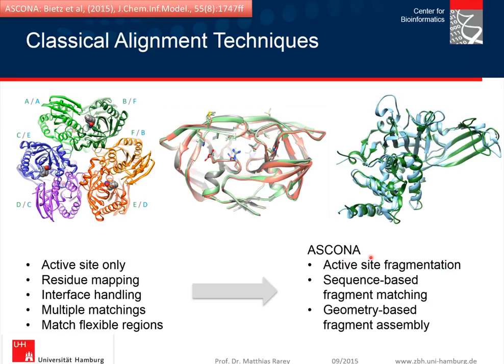tool, which is based on a fragmentation idea. It is highly sequence-based when it comes to looking where the fragments are in the structure, but it uses geometry to find out the right assembly of the pieces which form the active site. And what this means, I will show you on the next slide.